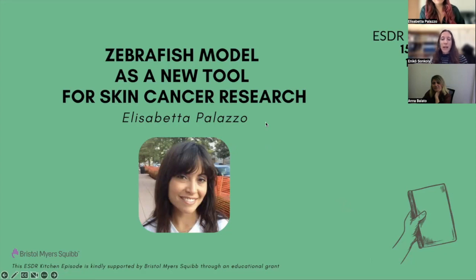After that, she came back to Italy and she's working mostly with skin cancer, animal models of skin cancer. And what is very exciting, she's working with zebrafish as a model for skin cancer. This is what she's going to talk about today and reveal the secrets of how to work with zebrafish as a model for skin research.